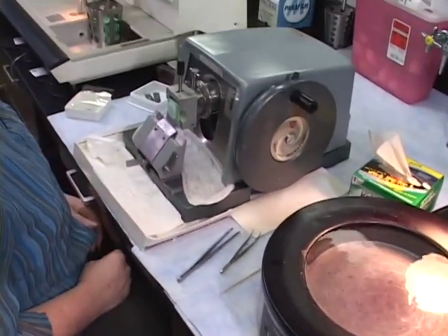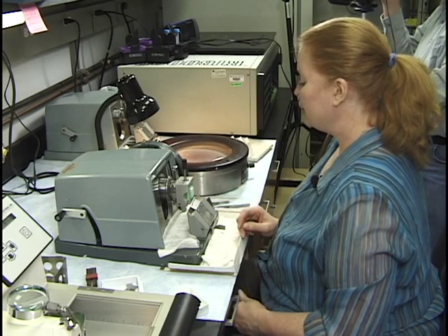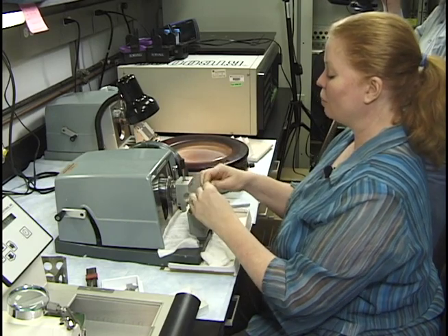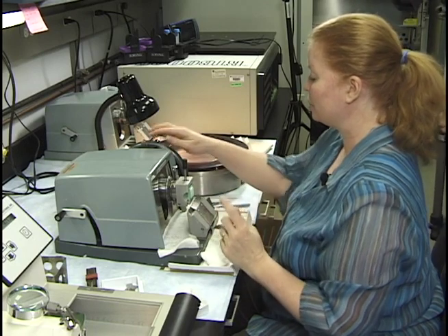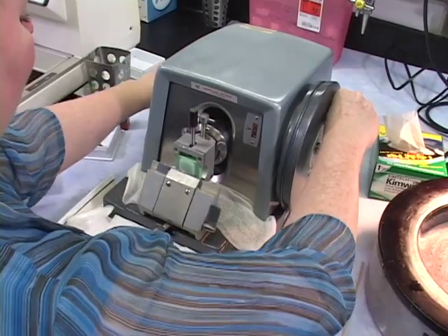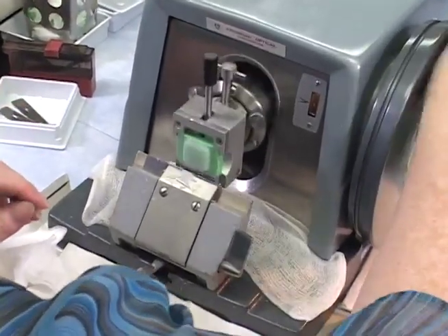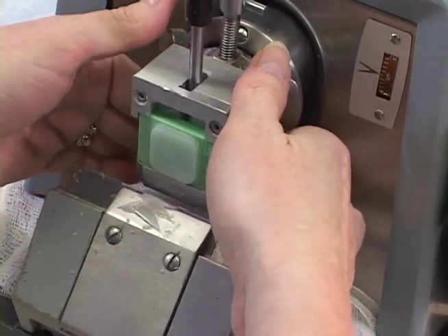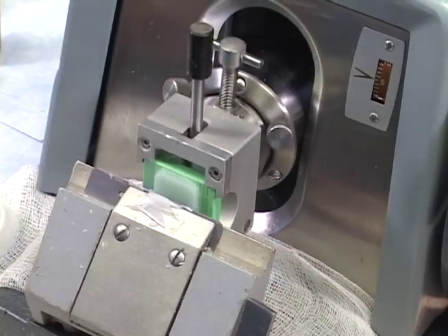Okay, another thing you can do, if you want to see if this is cutting nice and evenly and that you've aligned it very nicely, is you can actually turn the block face over, and if it's pretty close to the same alignment, it'll be pretty close to the same cutting on this side if you flip the block over. And I can see it's still slightly off. So I'm going to adjust mine to be a little bit closer for both sides.